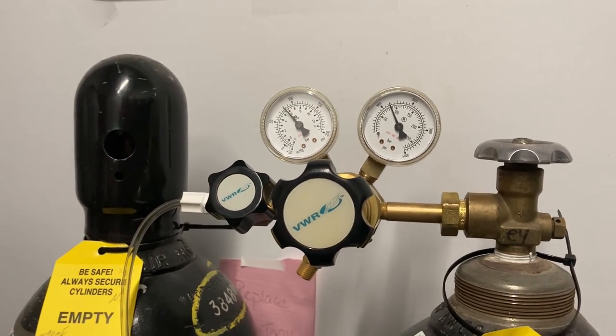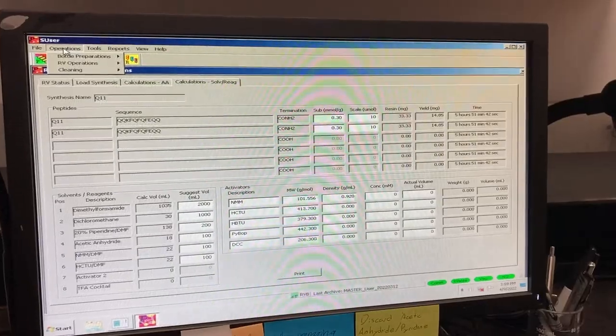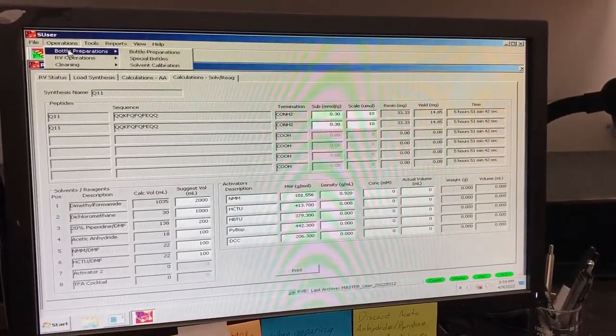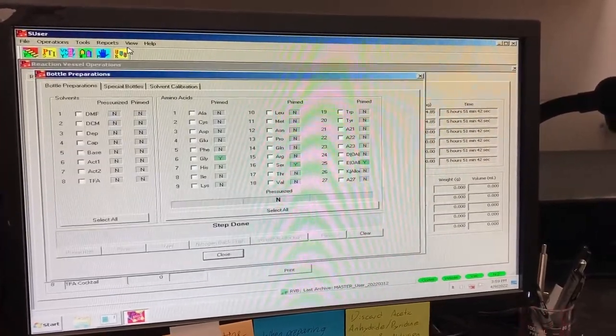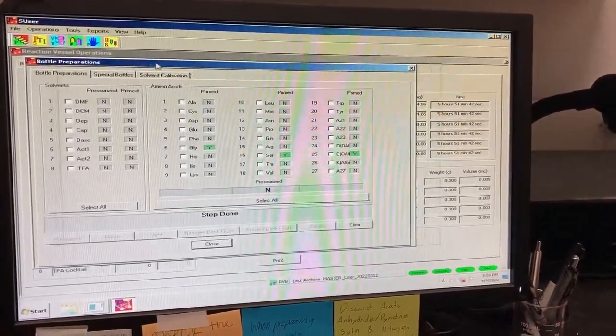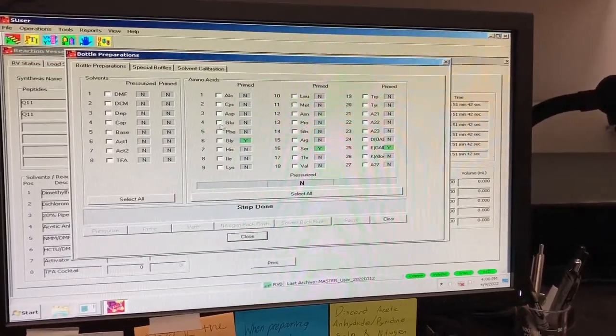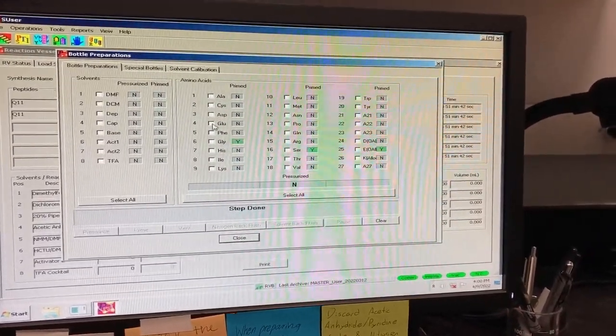Select all of the reagent bottles and amino acid bottles that you will need to use and prime these bottles.